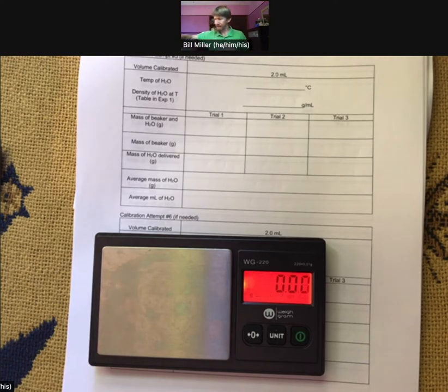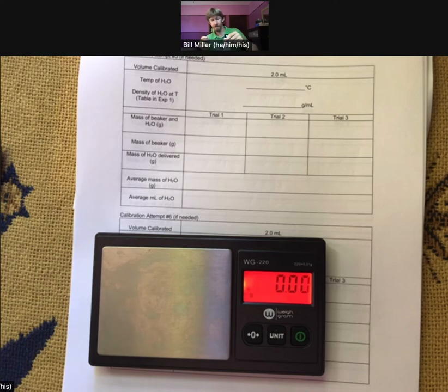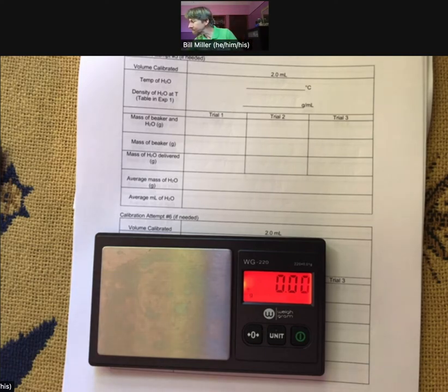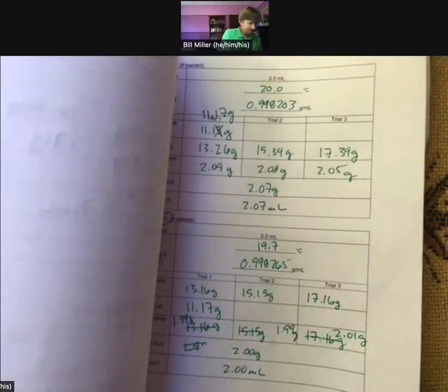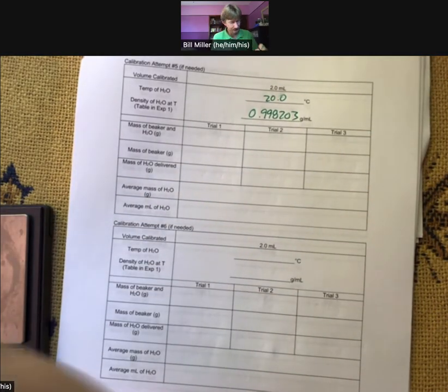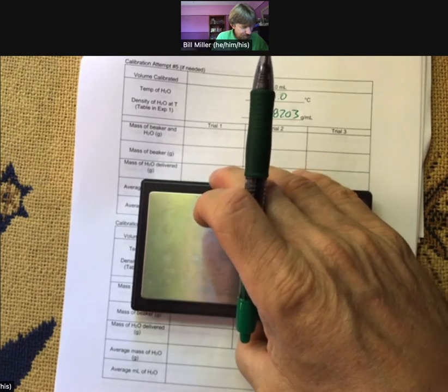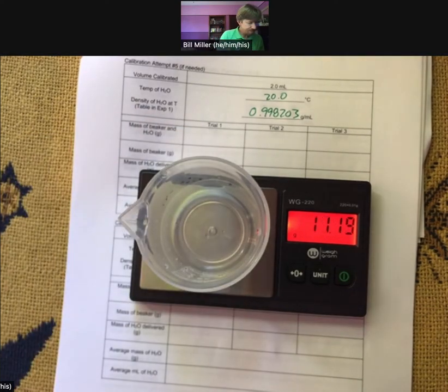I'll empty my beaker. Take the temperature — it's going back and forth between 19.9 and 20.0, spending more time on 20.0. I'll use density at 20.0: 0.998203.